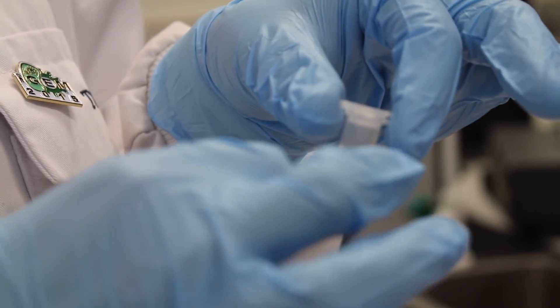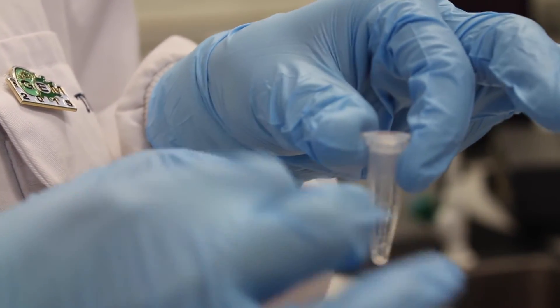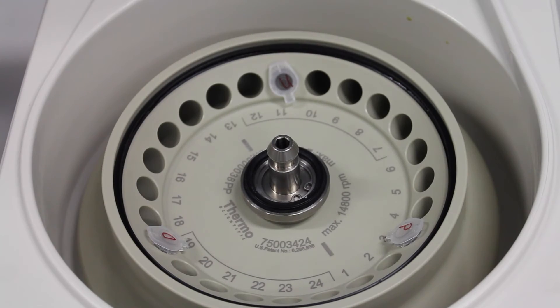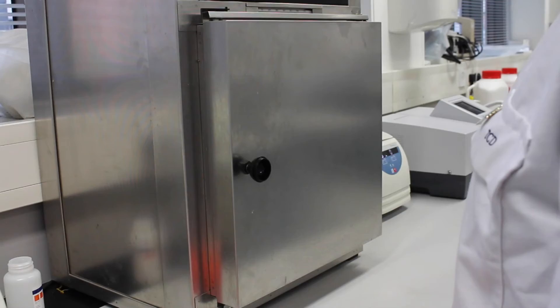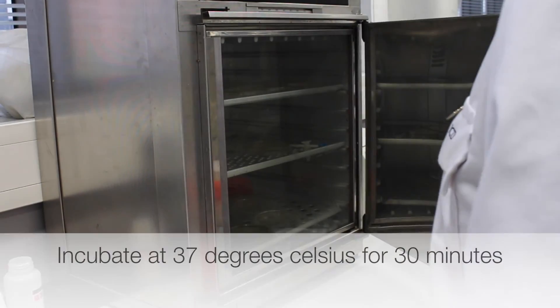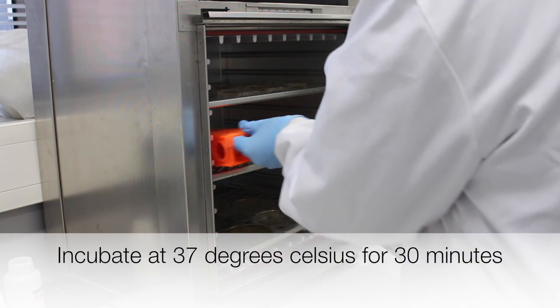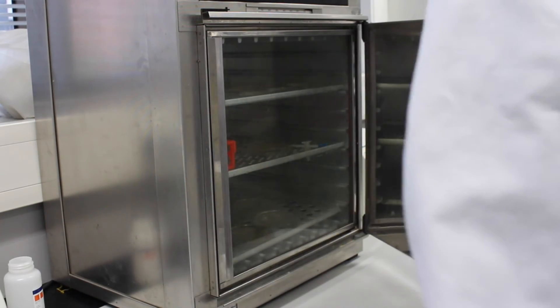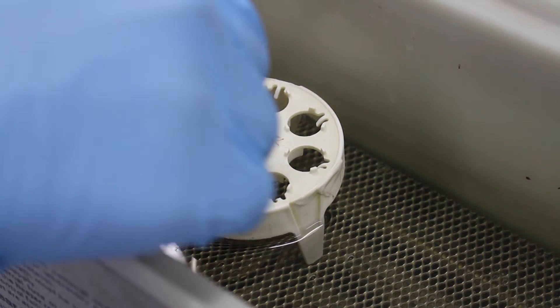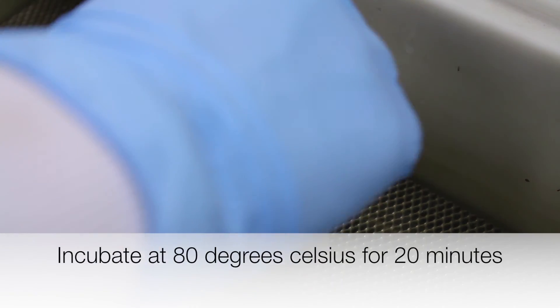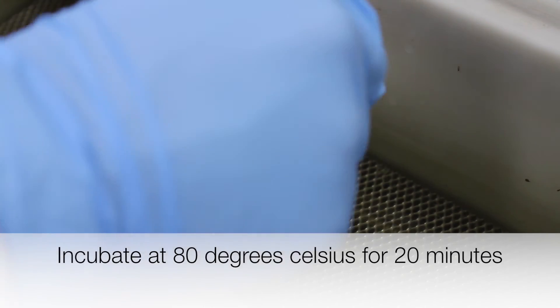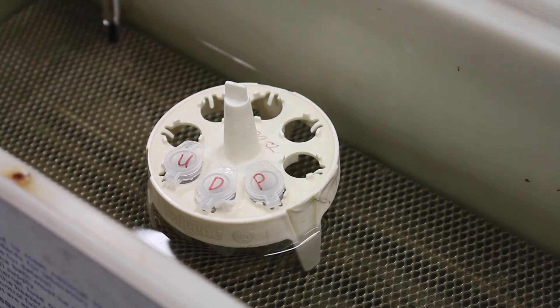Each tube is flicked in order to mix the contents. The tubes can be spun in the microcentrifuge for a few seconds to collect the liquid in the bottom of the tubes. The tubes are then incubated at 37 degrees Celsius for 30 minutes. After 30 minutes, the tubes are transferred to a water bath that's been set at 80 degrees Celsius and left for 20 minutes. This will denature the restriction enzymes.